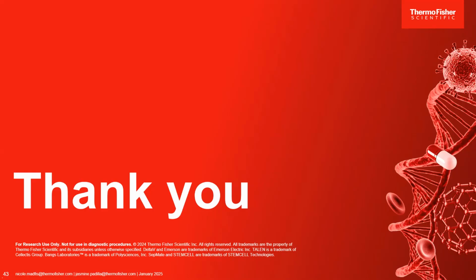Okay. We've got time for one or two more here. How fast does image processing occur? Oh, that's a pretty simple one. So really, it's also dependent upon the size of the image data. So the image processing itself can analyze the images up to 1,000 images per second. And that is based on a 248 by 248 pixel size.